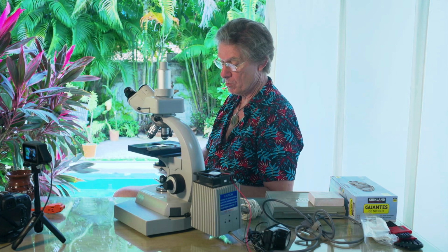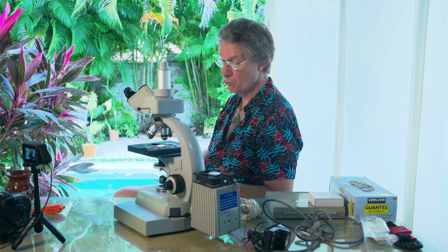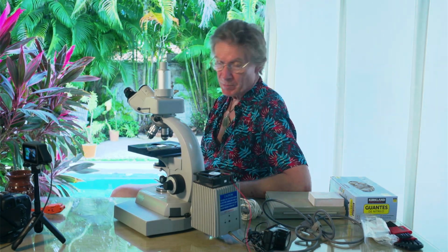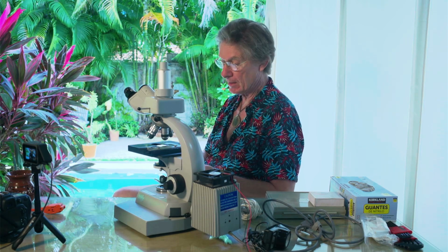There's an interesting concept in the world of live blood microscopy that is incredibly important that a lot of people don't know about, and it's called artifacts. Now, you hear the word artifact, and you think it's something you find in a tomb somewhere, or at the bottom of the ocean, or in a cave from a previous civilization on the planet. And it can be a spearhead or some pottery or something like that.